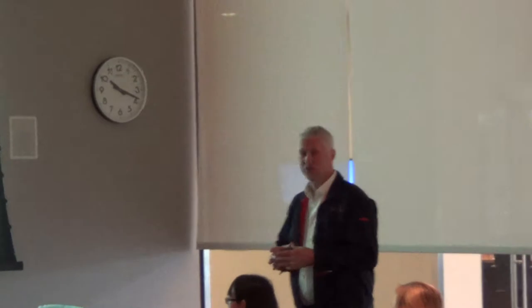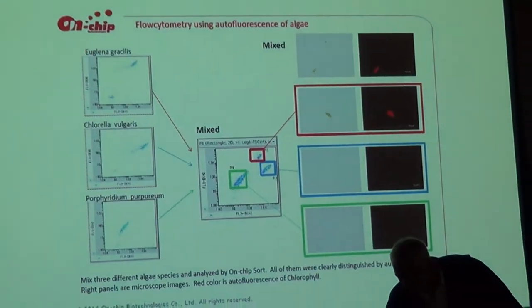That's where we crossed paths with Kevin, looking at how to optimize the Fluidigm workflow and get good samples in there. The Fluidigm mantra is, every cell and every expression is meaningful. So no garbage in, garbage out. The Fluidigm chip is pretty expensive to run, with lots of investment in getting that one sample with 2,000 to 4,000 cells looking good. That's what we're looking to do at a number of our customer sites right now, and we'll see how we do upstairs.